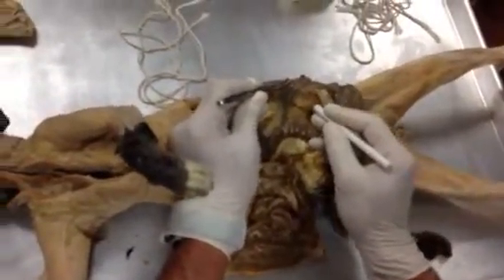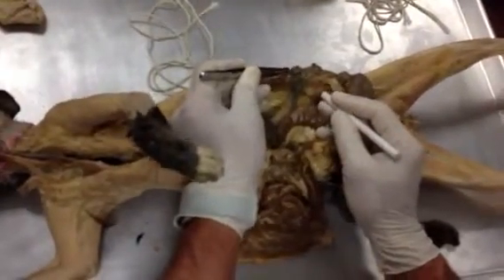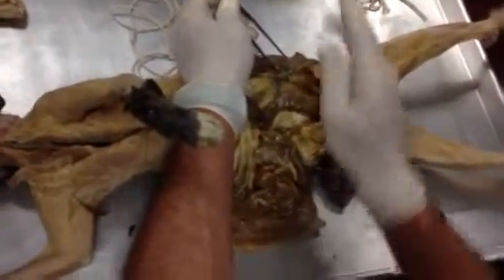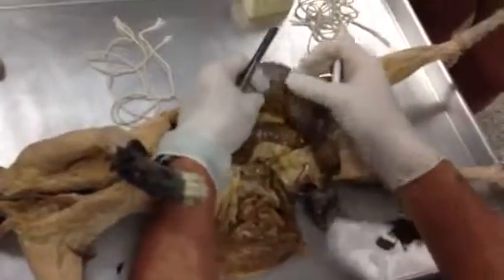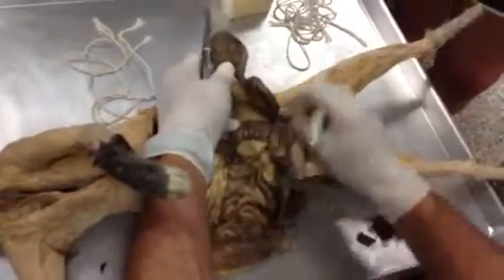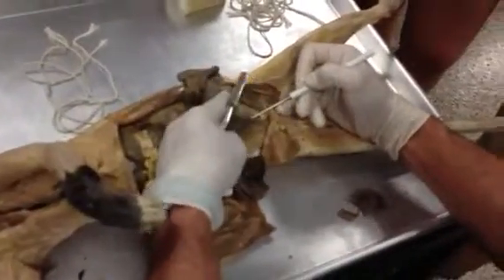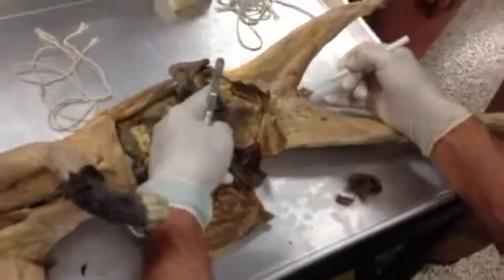Well, let's run through it. So there's the ovary, and there's the analogy to the fallopian tube. That right there is the uterine tube, a short little structure. That's it. Your fallopian tubes, ladies, are long. All right. So what is all of this now? All of this running down to there. Okay, this is the uterus. This is the body of the uterus. That's going to run into the vagina and out there.